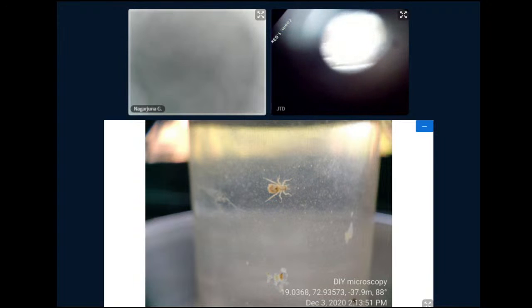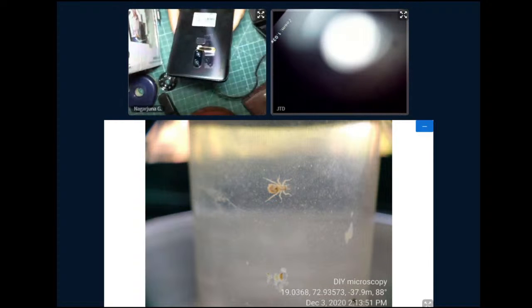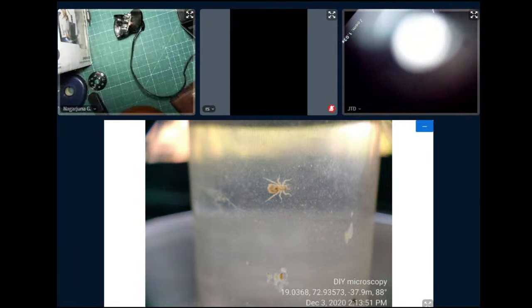I think Ravi also made an interesting post about this, and we can quickly see that as well. Ravi, you want to explain it? I will share the screen on the link. So I've got a very good other lens, which I showed earlier, which is a professional lens, but that has an auto iris, so I have to hook up some external circuitry to open the iris.